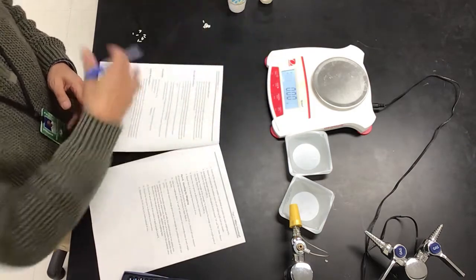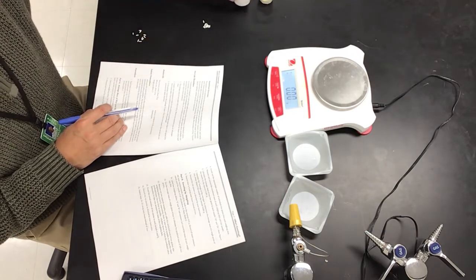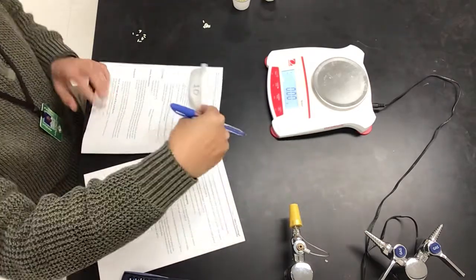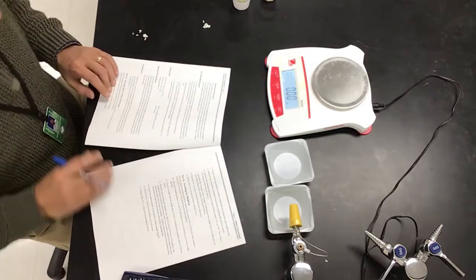I've already prepared the sample here. You have navy beans, here's a navy bean. You have rice, grains of rice. You have 2 weighing dishes, labeled 10 and 20 already. Then you have the balance scale, all right?